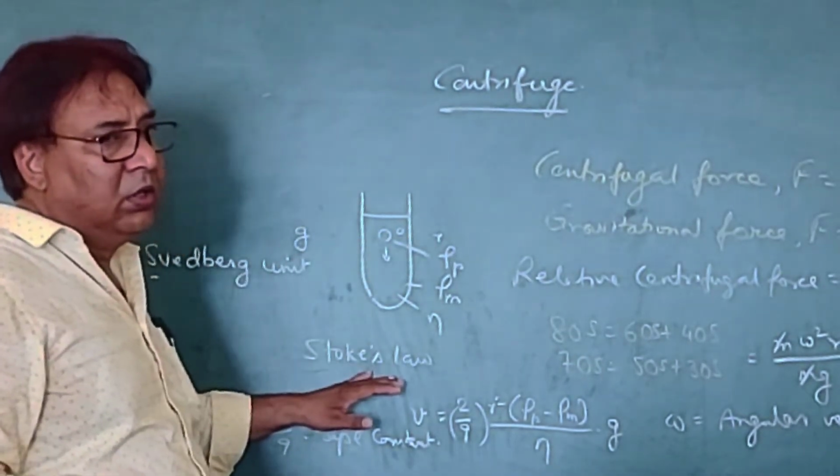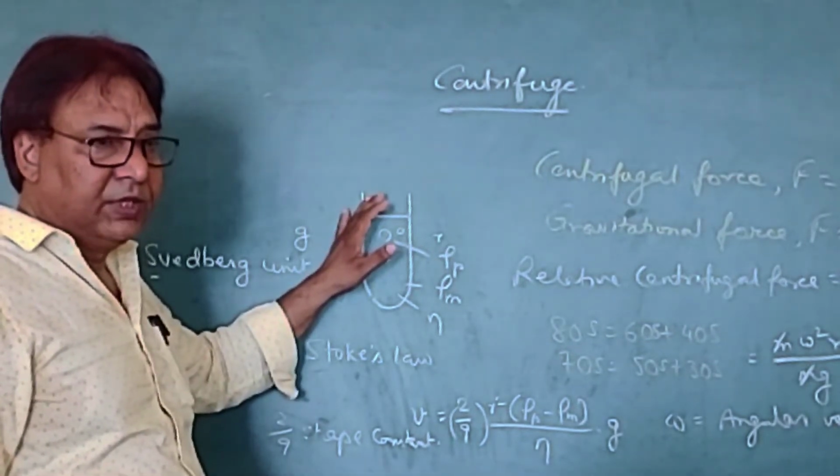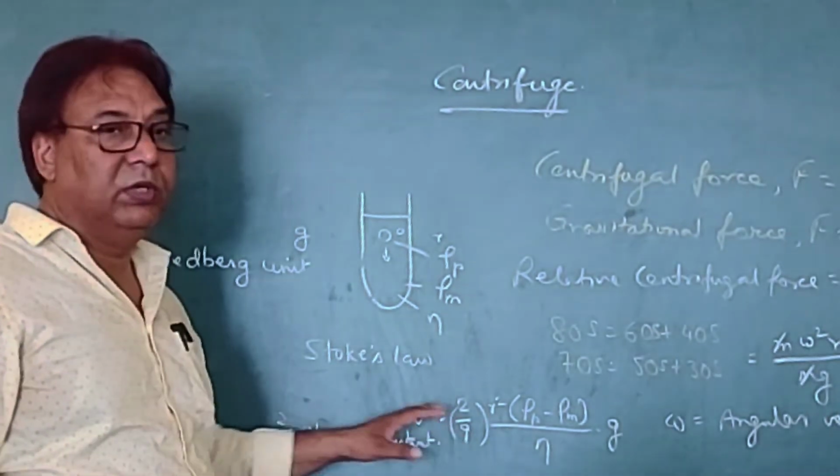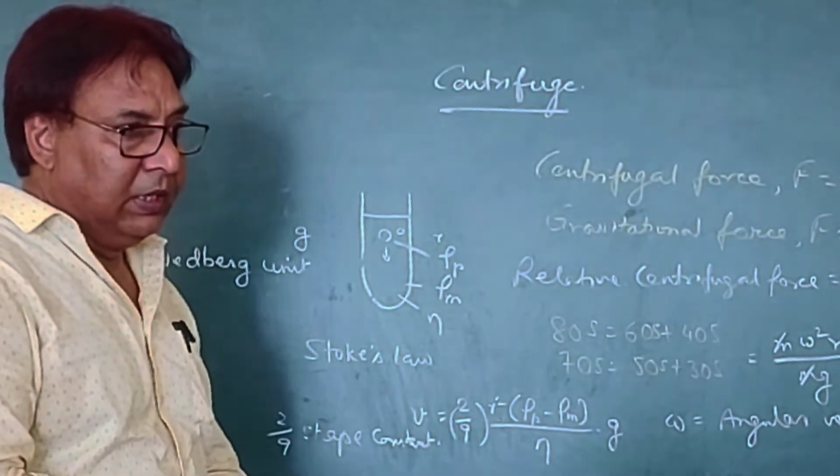And Stokes' law works upon that particle. Every separating, settling particle, this particular theory will work upon.